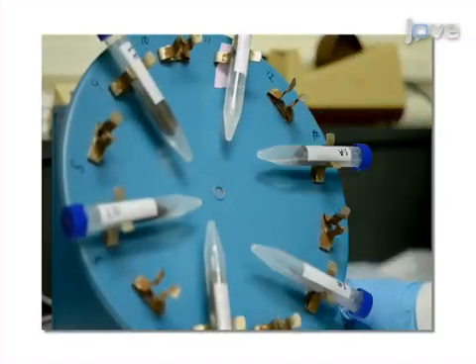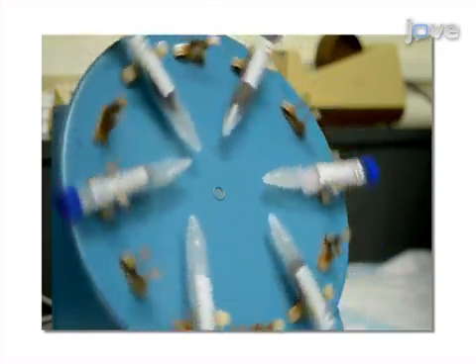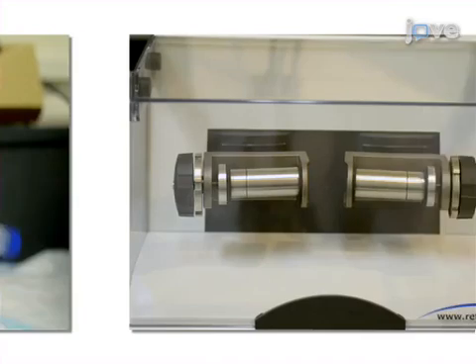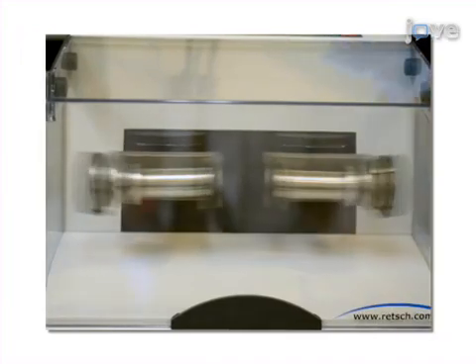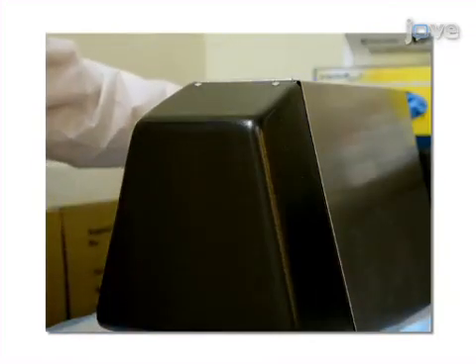This is accomplished by first washing the sample in isopropanol to remove any excreted cortisol from the external surface of the hair. In the second step, the sample is ground into a fine powder to break up the hair matrix and to increase the surface area for extraction.